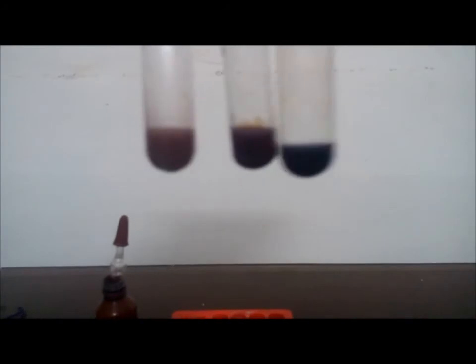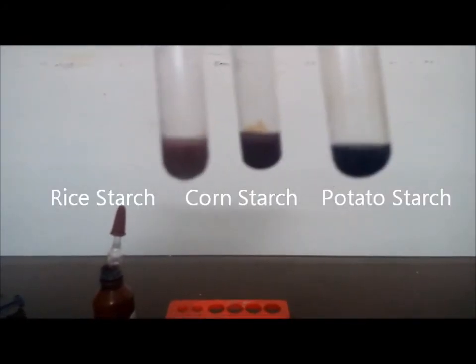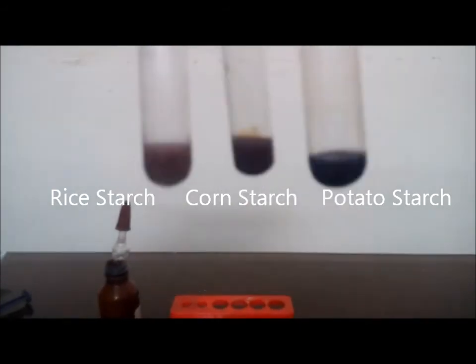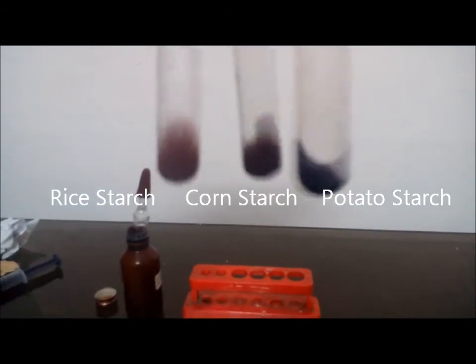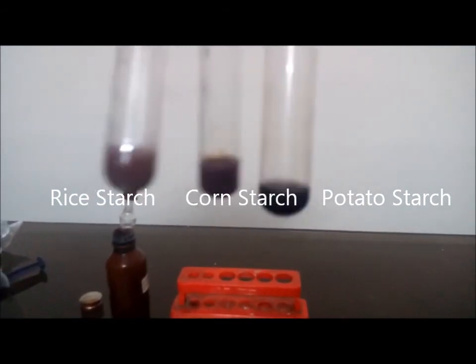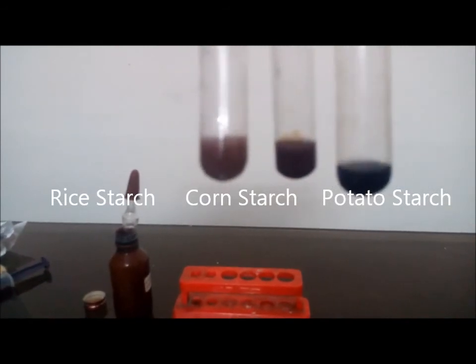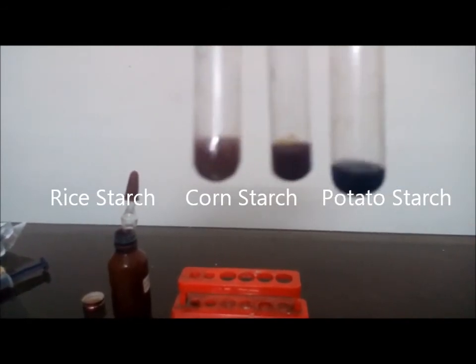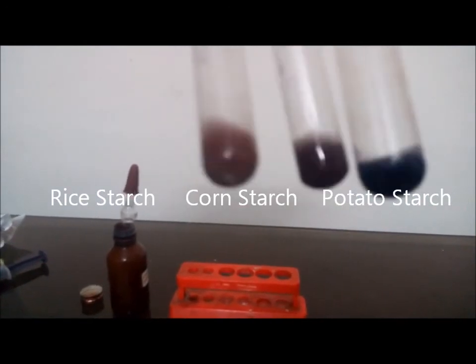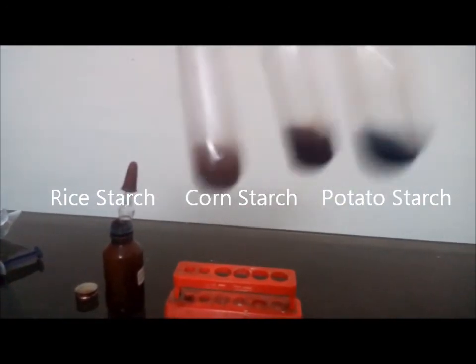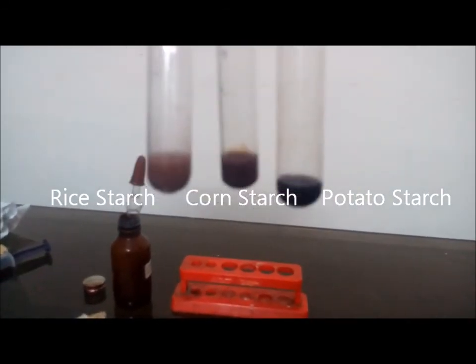Now you can see the color of the three solutions. You can see in the leftmost one, the rice starch sample is the lightest - it is light violet color. Then the middle one, corn starch, is a dark brinjal purple color. And then towards the right, the potato starch is completely blue-black color. So a very clear-cut observation I can make from this.